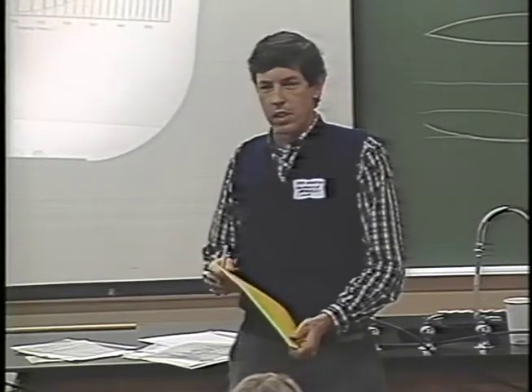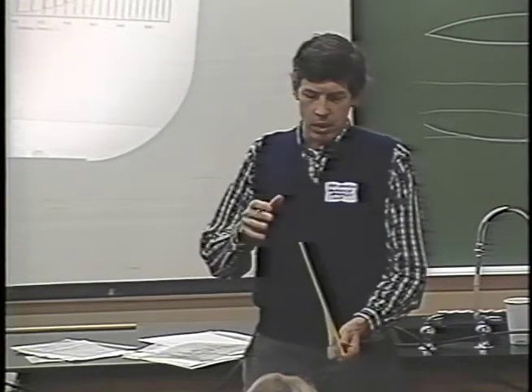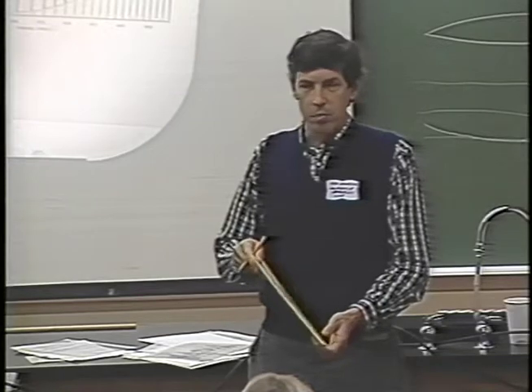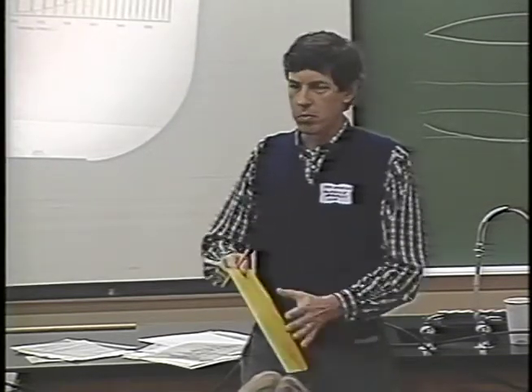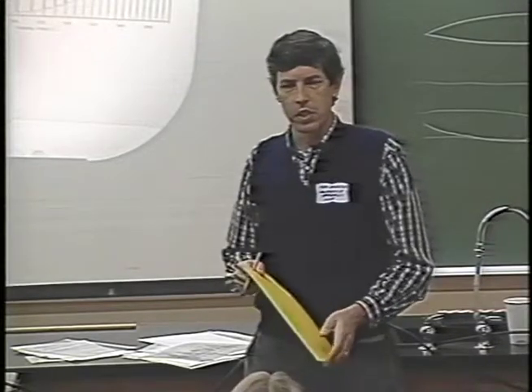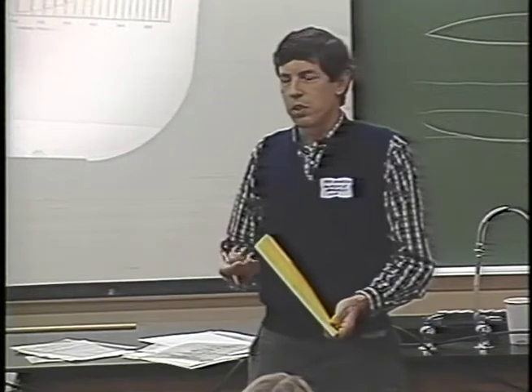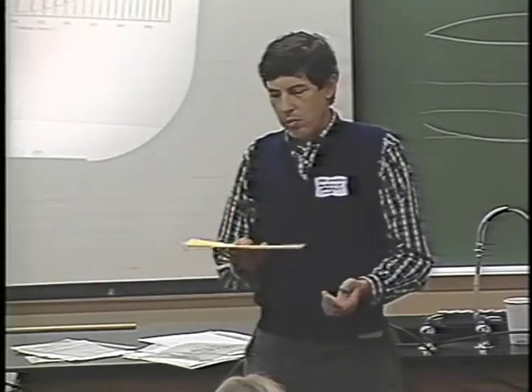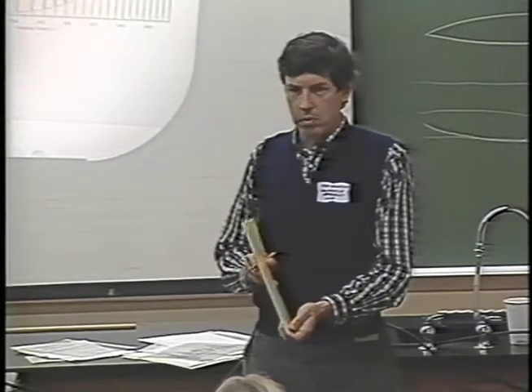It's not worse, but at least it's not yet solved. That's something that we'll have to solve with some improvements to the cold stage perhaps, or better specimen support, some sort of mechanical stiffening of the grid that reduces the vibration. Because we do have to work with the tilted specimens. In order to get the three-dimensional reconstructions, we have to be able to look at specimens at different tilt angles.